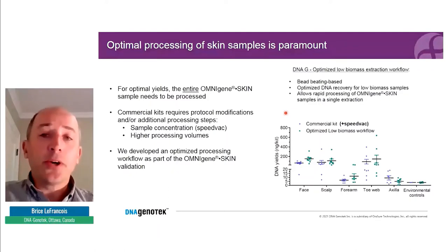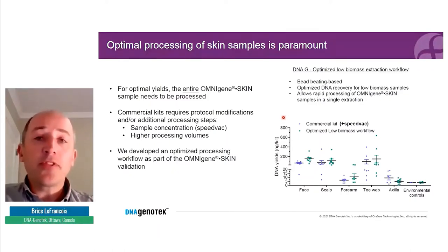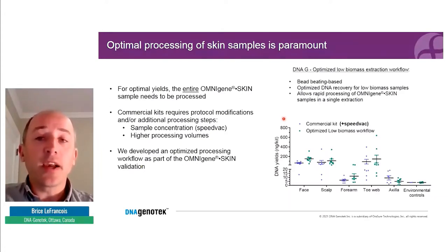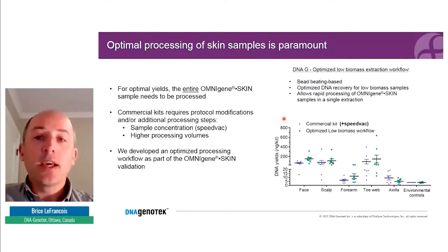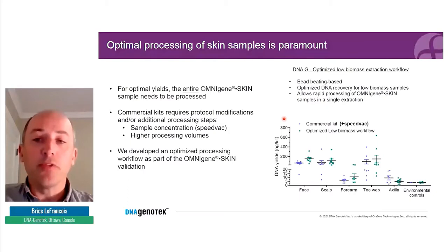One of the things we realized very early on is that optimal processing of skin samples is paramount. For optimal yields and results, you really need to process the entire OmniGene Skin sample in a single extraction. We tested commercially available kits, but the problem is that they usually don't accommodate a one-milliliter input volume. So we had to do bead concentration of the sample to lower the overall volume, or modify the protocol to accommodate larger input volumes — and none of these approaches were really ideal.